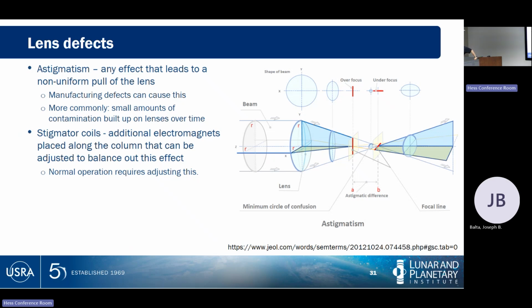Okay, so can electron microscopes. This is a misshapen beam. It is a non-uniform magnetic field. So if the magnetic field on one side versus another is not precise, it will lead to a beam that is slightly off-center, just like what's going through my eyes.